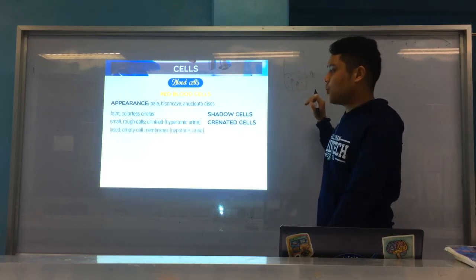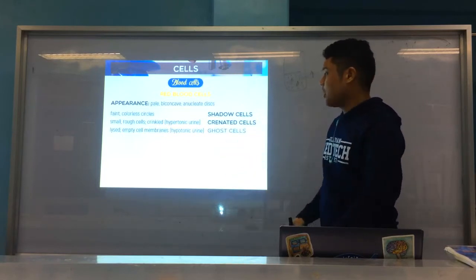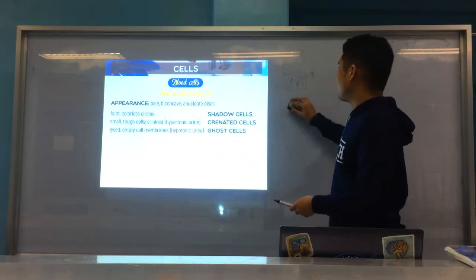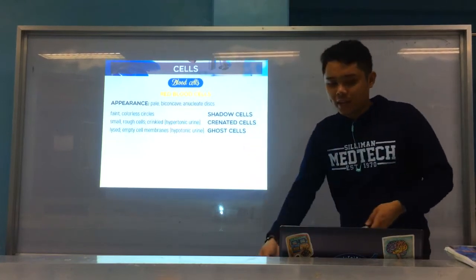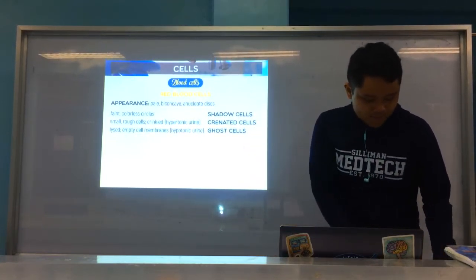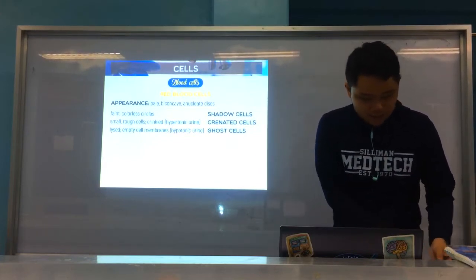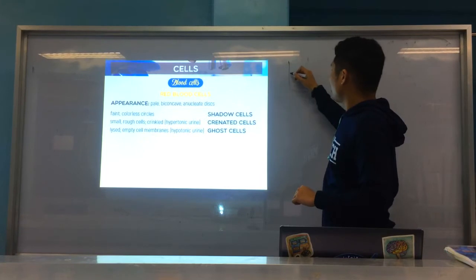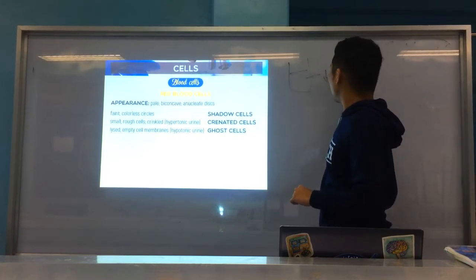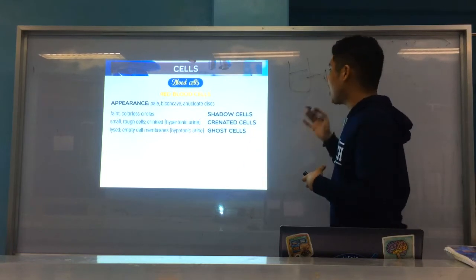Now, for the next part, you have lysed or empty cell membranes. In hypotonic urine, you have ghost cells. Hypotonic means decreased concentration, so the concentration of the solution or urine outside is decreased.